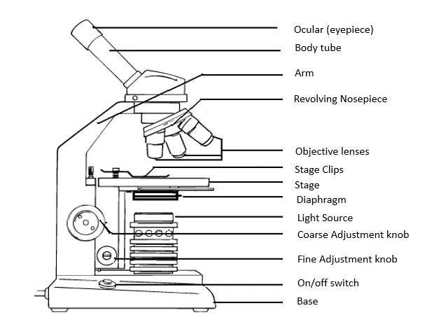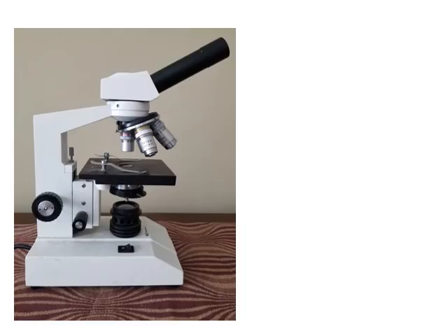Now, this is a real live microscope, all right? It's at my house. So we're just going to kind of go through. You don't have a picture of this. I just kind of want to go through and show you. These are kind of the microscopes that we're going to be using in school. Some of them are a little bit different from this, but this is a typical microscope.